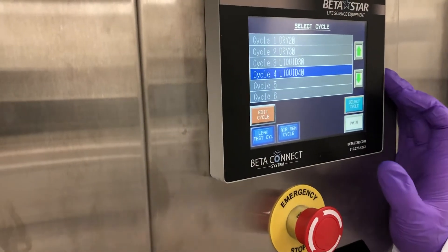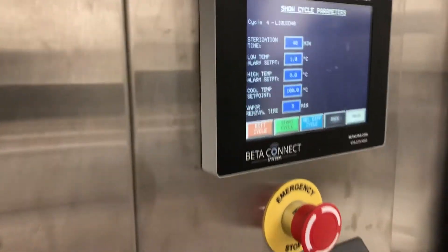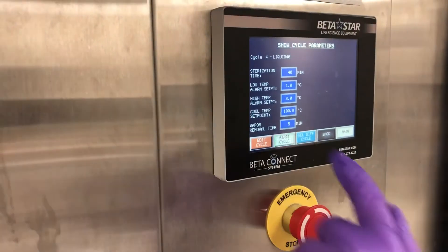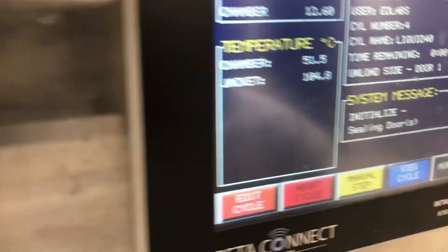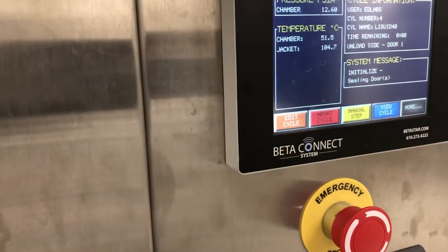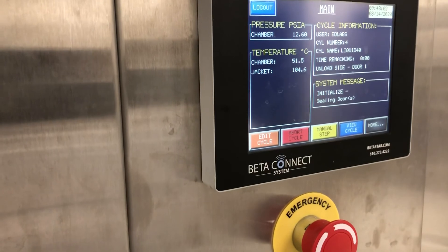Then say select cycle and go through the next panels. They're telling you here's the 40-minute sterilization time, and all of these other prep settings are set so that vapor escapes safely without the flasks overheating. Then start cycle, and it'll prompt you for yet another confirmation. That reassuring click that we heard — that was the door beginning to seal. There's a sealing door message here. It takes about an hour and a half before the whole thing is completed.